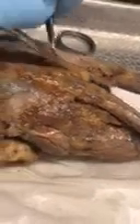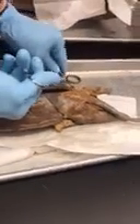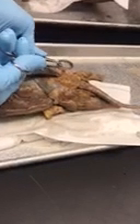Now underneath, what we're looking for is muscles, right? So underneath, you're going to hopefully see some muscles and their specific fascicles or bundles of cells. And what I'm doing now, occasionally I nick a muscle, and you can usually tell there's a distinct difference in the way those tissues look. So that dark pink, that's where I nicked one.